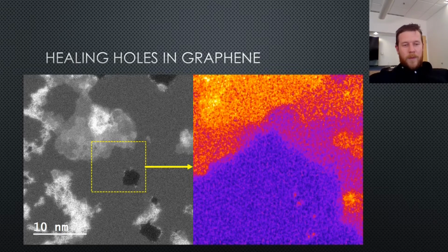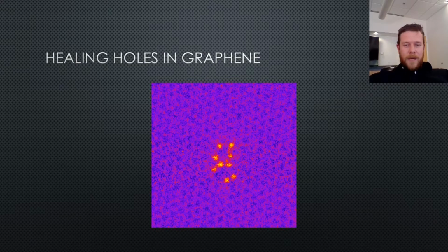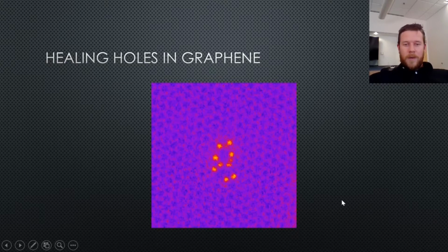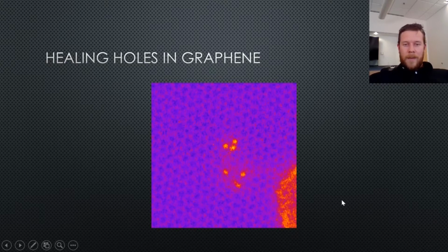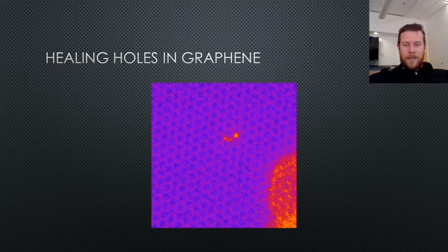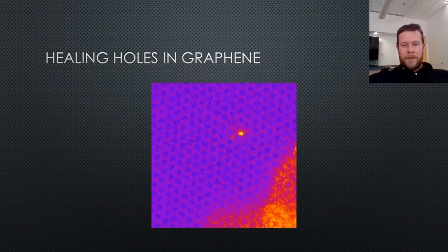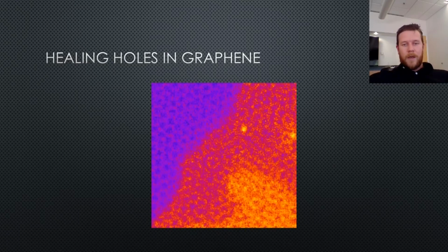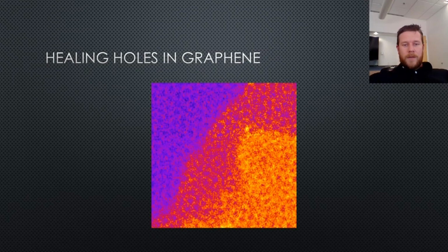Oh, I do have one more example. So what happens if you have dopant atoms that you don't want there? Well, if you're able to get a little bit of carbon close by, perhaps we can get rid of those interstitial or substitutional defects. And you notice the lattice heals completely. We're not just knocking the silicon dopants out of the lattice. It's actually healing the lattice. It's being replaced by carbon. So likely this is a chemically assisted process.